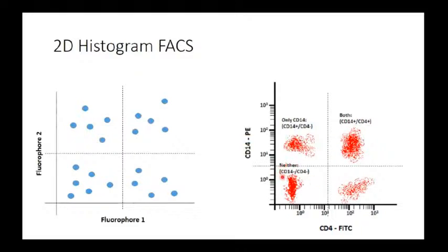These cells are CD14 and CD4 negative because they are giving low signal on both detectors. And these cells are expressing CD4. They are giving high signal on the CD4 detector, but they are giving low signal on the other detector, so they are expressing only CD4. This is a very simple example of how the data looks in the two-dimensional histogram.